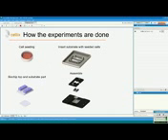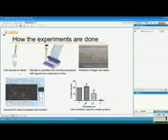When we use the VenaFlux biochip, cells are first seeded on the plastic substrate, and this is then grown over 48 hours inside a conventional incubator. Then the plastic substrate is inserted into a frame, and the top part is clamped against the cell substrate. This allows us to run two parallel channels side by side, flowing the leukocyte cell suspension or isolated leukocytes through the microcapillaries.